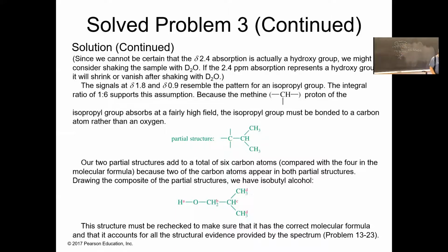Okay, we can do the same thing with NH bonds. If we're not sure if we have an NH peak, we can shake it with a small amount of D2O and see if the peaks disappear. In one of my graduate student projects with a student here, we actually did this in order to demonstrate that a particular peak was from an alcohol.